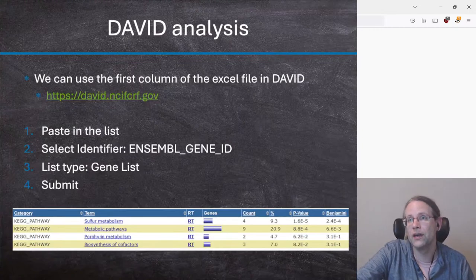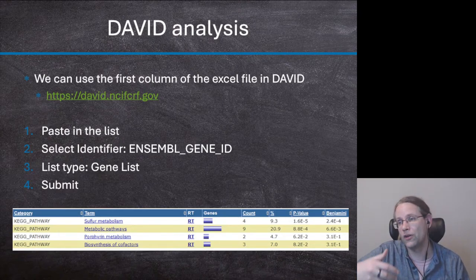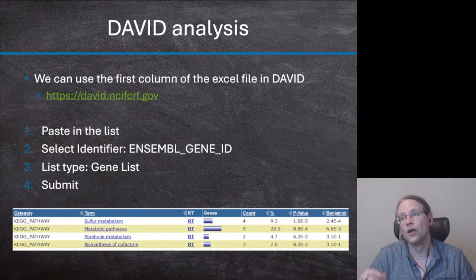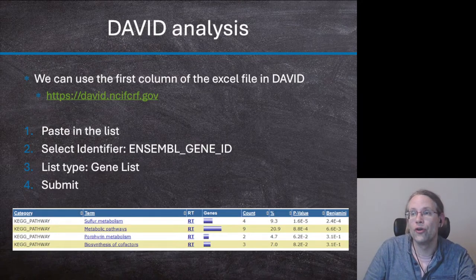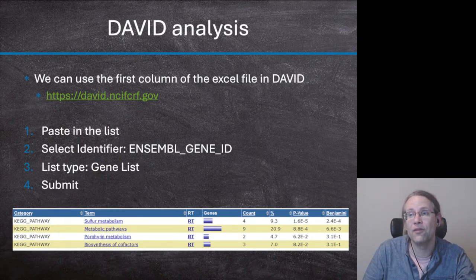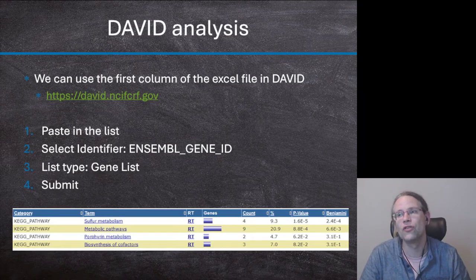Generally for bioinformatics, we don't really go into what it means. For that, we have a biologist. The biologist wants to do a certain analysis, we do the analysis, but we can already do these kinds of analyses and see if it makes sense. Even though, like Florian pointed out, we don't really have the power to do this experiment, it's only 3 versus 3, and we're looking at 7,000 genes in total, so we can never prove which gene is interesting.